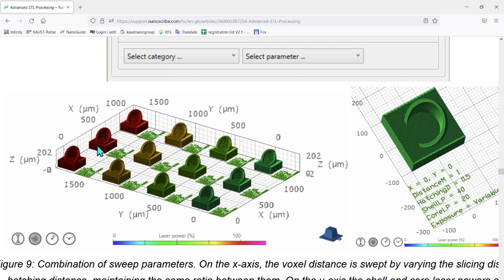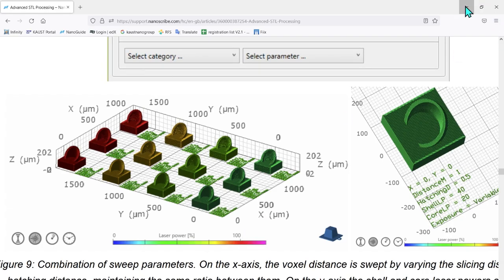After the exposure and development, we will be able to inspect under the SEM microscope, and because you can see here that NanoScribe is writing the parameters for each structure, you will be able to choose the one that is the best. And then you will grab these parameters and input these values in the program that I showed you before. So let's start to do this.